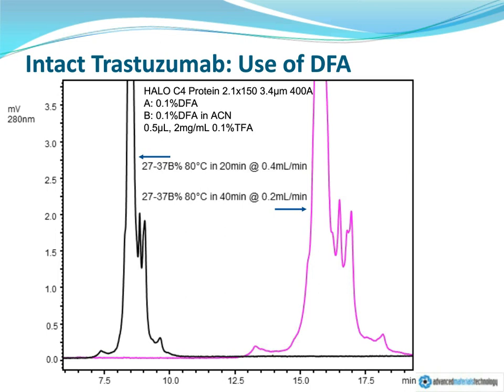And in this case, I'm showing this example to identify that even though we have designed materials with large pore sizes and thin shells and improving the kinetic conditions that will allow higher resolution, flow rate still remains a considerable variable in terms of being able to get maximum resolution out of any chromatographic material when you have an analyte, which in this case is 150,000 molar weight.